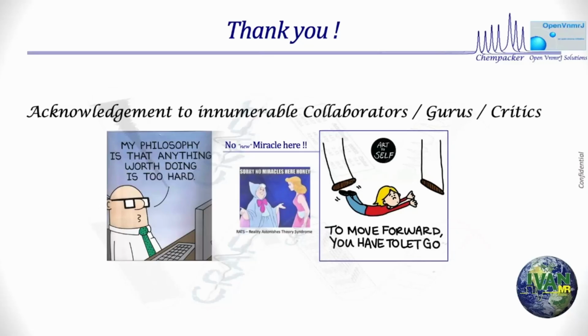But if we take that jump, if you drink that Kool-Aid, then there is so much we can do without living with the limitations, without living with the consequences of that limitation. I am not saying non-uniform sampling is bad. Of course, but all of this will work even here too. You can have non-uniformly sampled data and get a better tabular domain. You want to do an aliasing that works for you? Go ahead and do aliasing. Go through a tabular domain. So you have another place where you can play with your data. Less uncertainty, really. This is the process-induced uncertainty we don't have to live with. But then again, I'm a chemist.